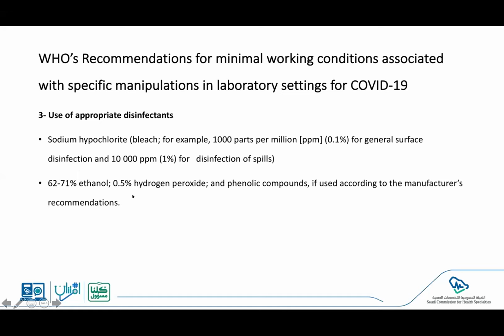Of course, you need to have disinfectants. Sodium hypochlorite or bleach is recommended for general surfaces at about 0.1%, and for disinfecting spills at 1%. 70% ethanol is recommended as well.